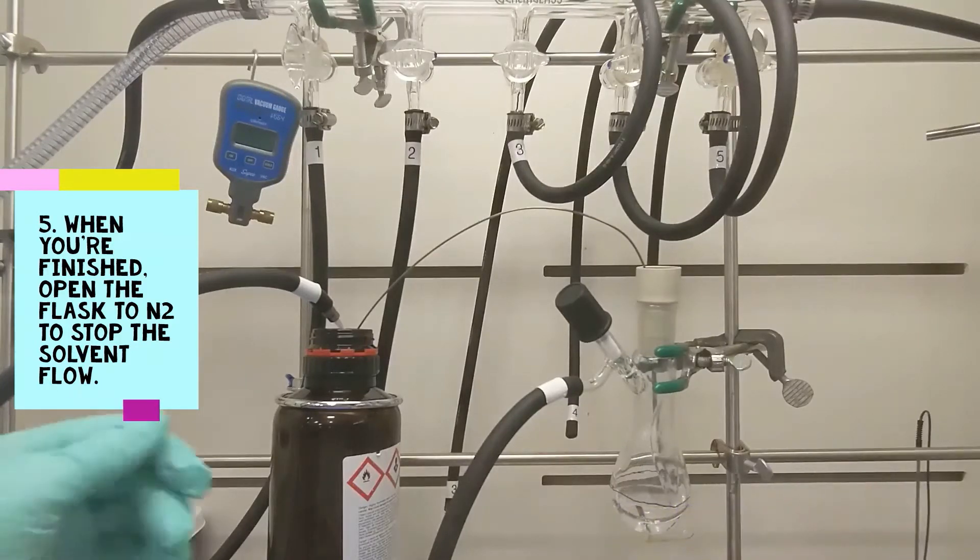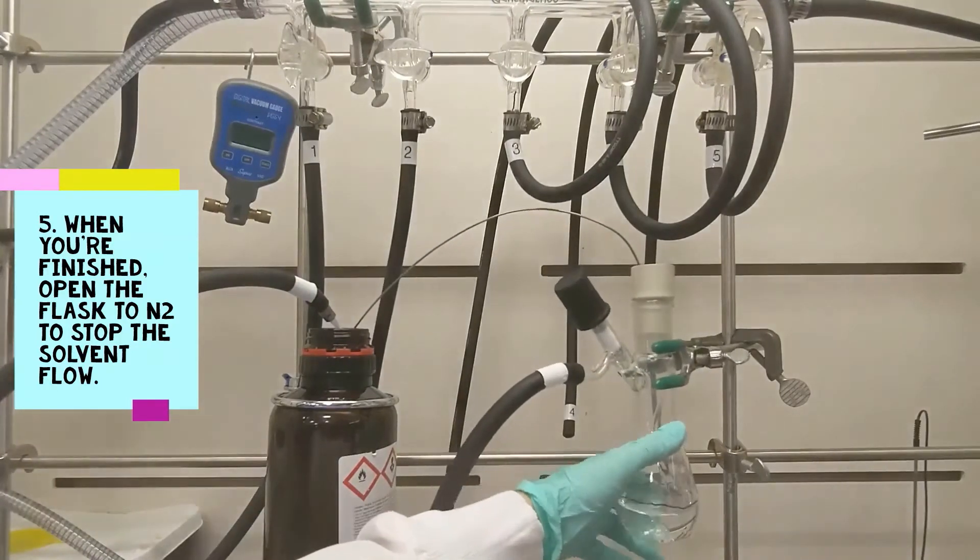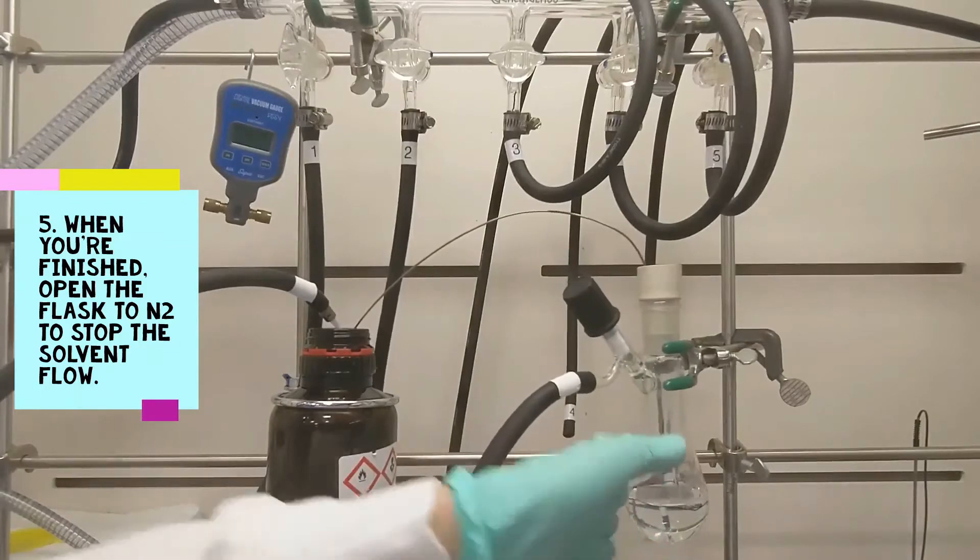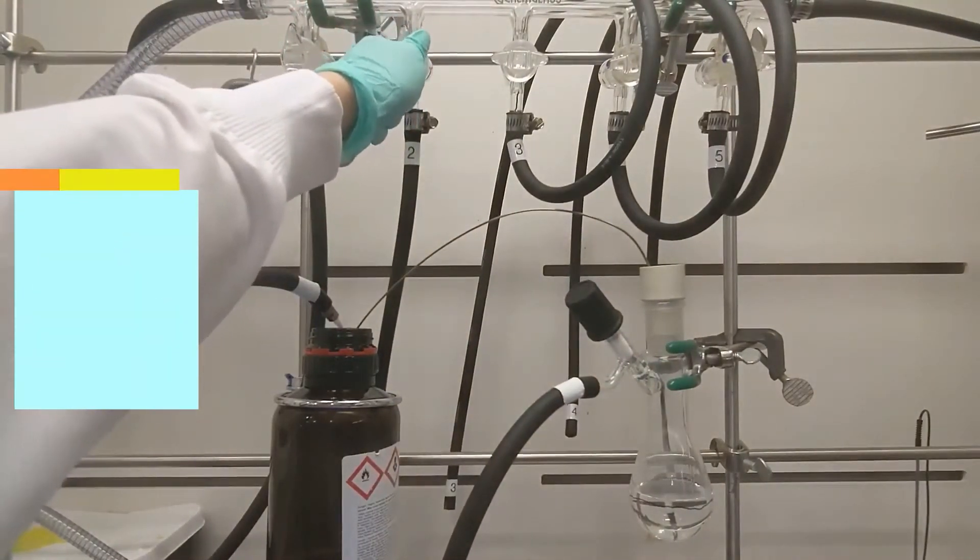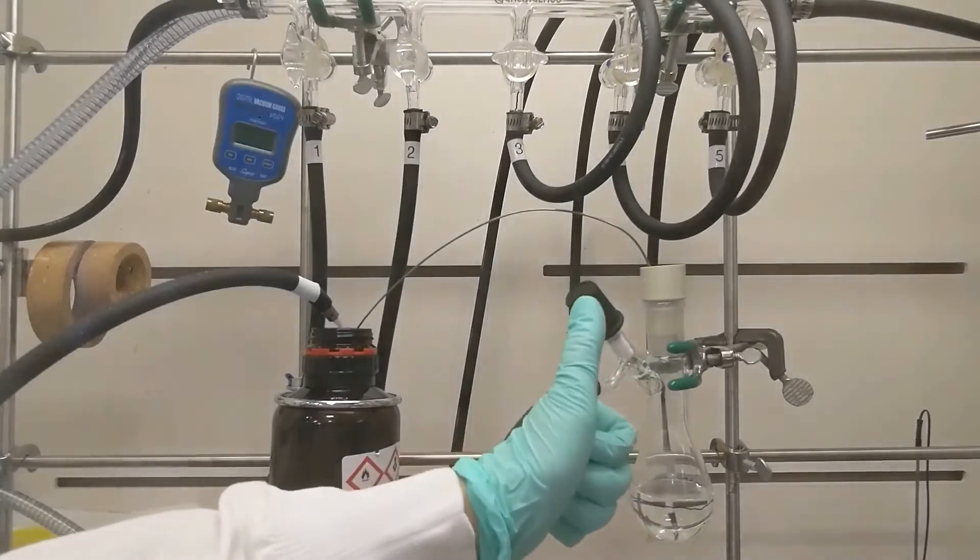Finally, step five, to stop solvent flow, open the flask to nitrogen to reintroduce positive pressure. This will rebalance the pressure across the system and stop liquid from flowing.